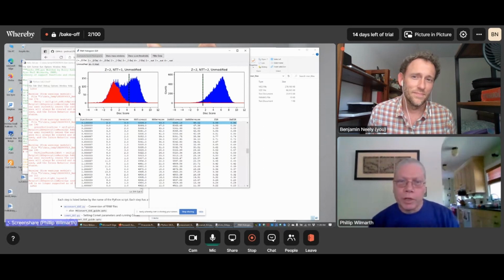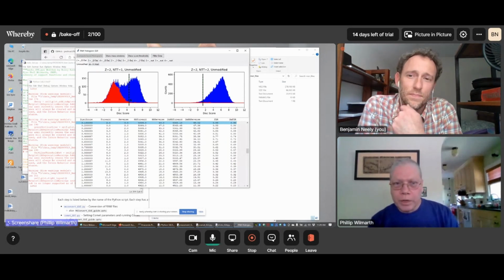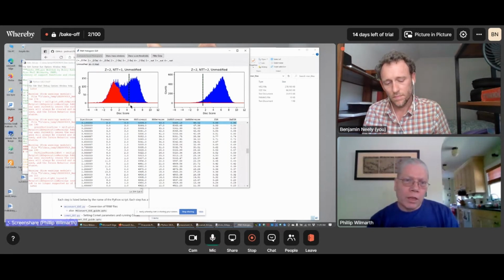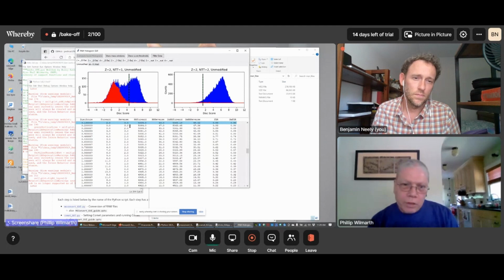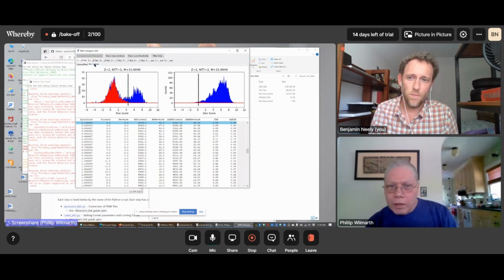And this improves the separation between the correct and incorrect distributions. So we see that the incorrect distribution, generally speaking, is pretty well separated from the correct distribution, and that allows us to recover identifications with pretty high sensitivity. If you looked at score distributions with just the sequence cross-correlation score, then these two distributions would be much closer together, and it's much harder to get a 1% FDR and recover as many of the correct identifications. So this discriminant transformation really improves your error control and sensitivity. Okay, and we've got oxidized methionine.